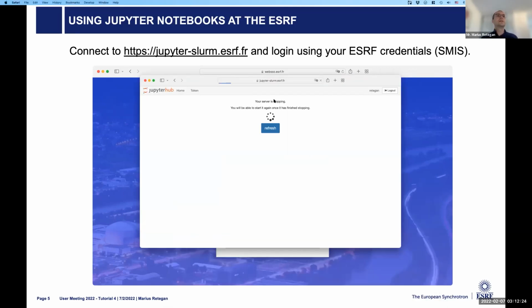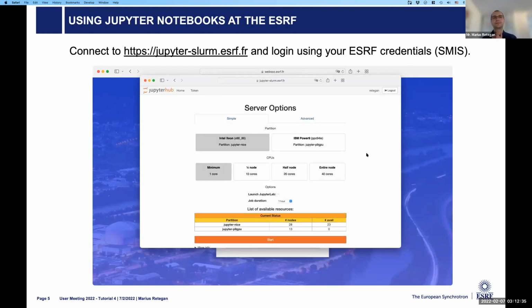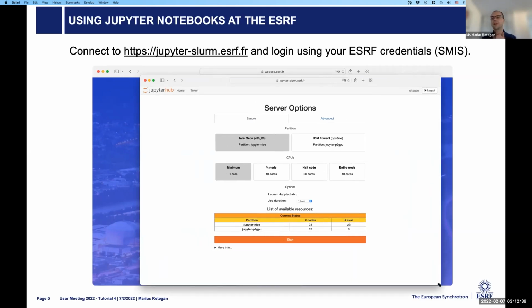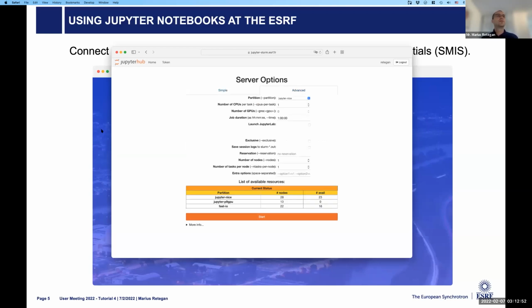Okay, so start my server. Okay, launch server. So you should be here, right? Is that correct? I mean, yes. I think we're not many of us, yes. If you don't have background noise, you can just unmute yourself if it doesn't matter. Then you should go to advanced.